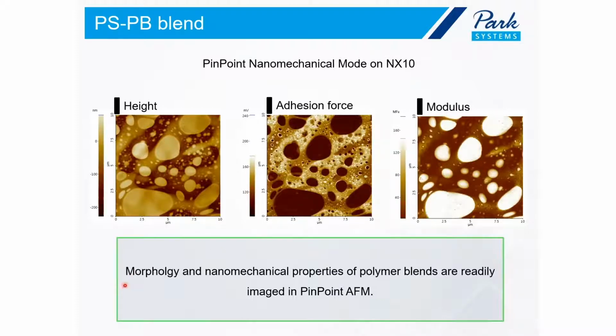So these properties are readily imaged in PinPoint AFM. There are other channels as well. For simplicity, I'm only showing three of them. You can also have stiffness, energy dissipation, and deformation of individual domains. And this image is about 10 by 10 micrometers.